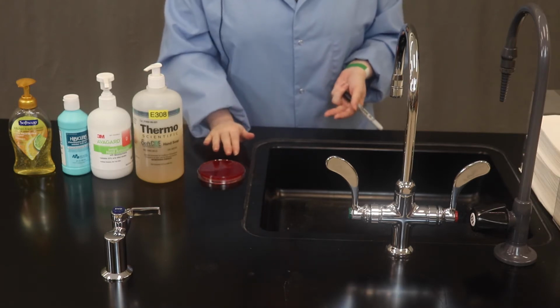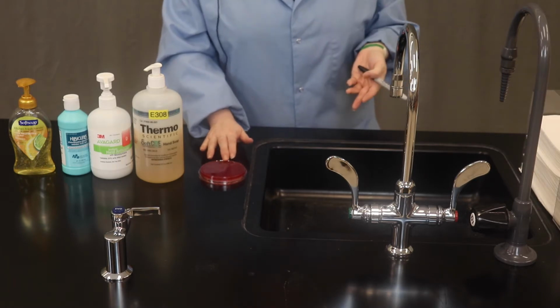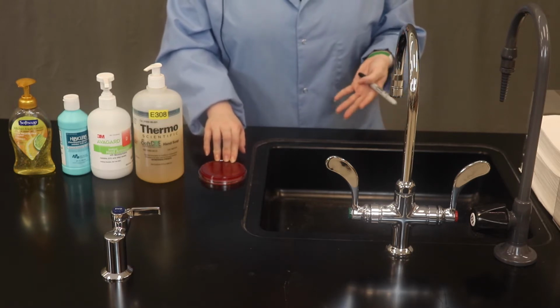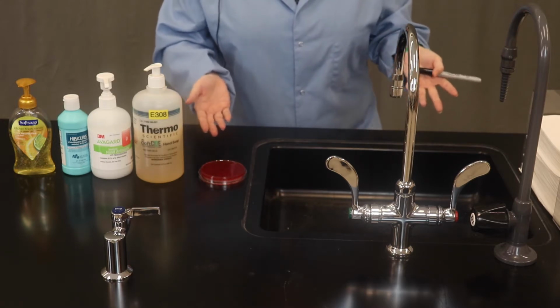Your instructor could choose different types of media. They could pick mannitol salt agar if you wanted to look for staph on your skin, or other enriched media like brain heart infusion agar. So just take note in your particular lab manual of what you're working with in your class.